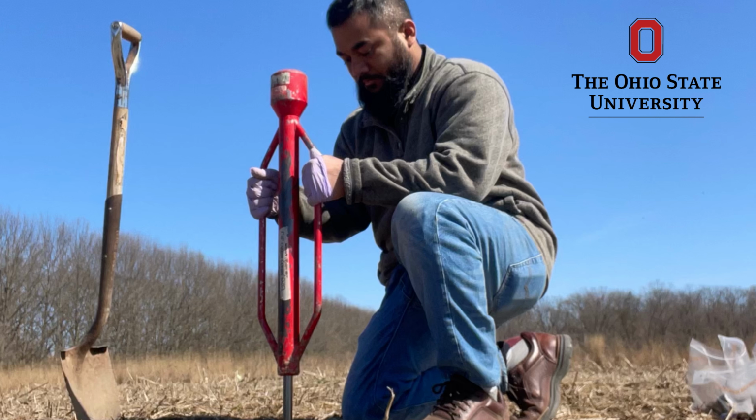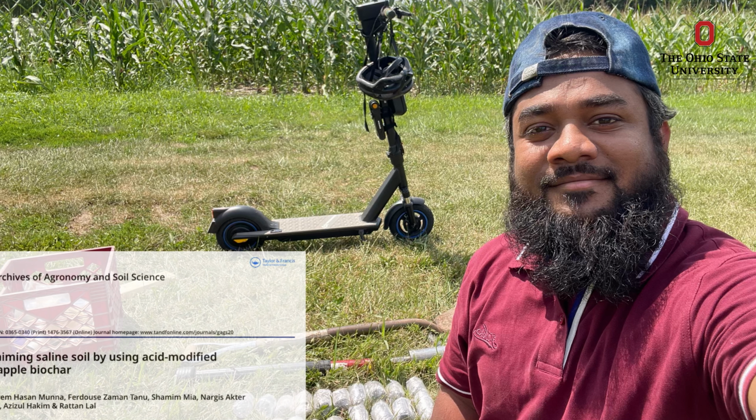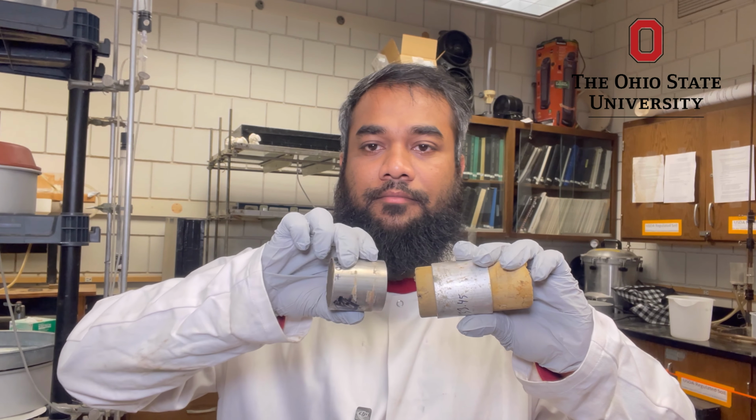An undisturbed soil core is collected by inserting a metal core vertically into the soil, minimizing disturbance. Step 2 is trimming the soil core. Excess soil is trimmed from the top and bottom so the soil is flush with the core edges, preserving the exact core volume. Step 3 is wrapping the core.